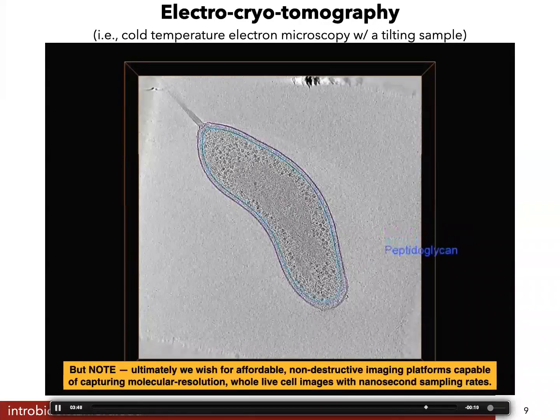However, what are some of the limitations of this microscope? First off, it's really expensive. I don't have one of these. People on my team, they get to use it, but we have to go beg or borrow for access. And we're really grateful we can use it. Who can afford a $10 million microscope? Hardly anybody. So it'd be nice if this cost like $10. Would that be possible?